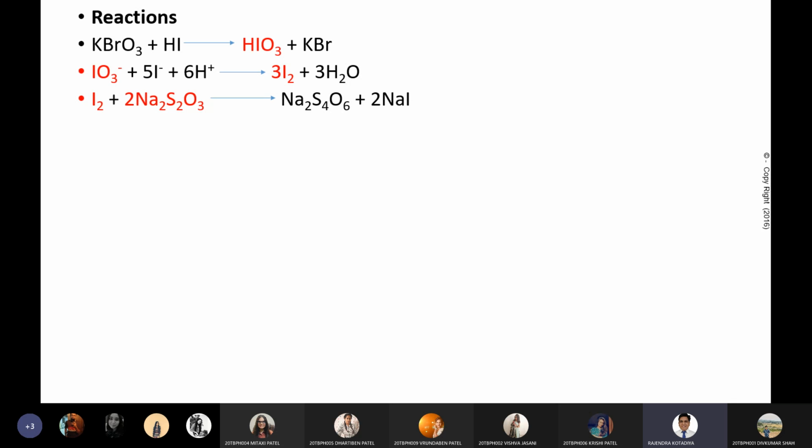So what does it mean? If you compare KBrO3 and iodine, what will be the relation? Sir, KBrO3 requires 6 iodine.